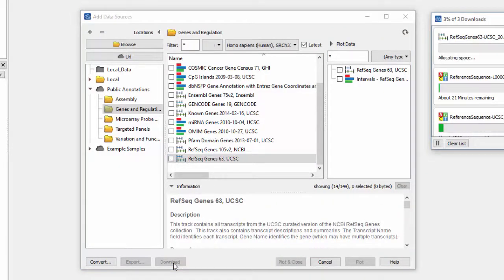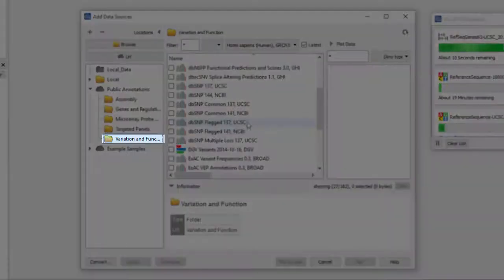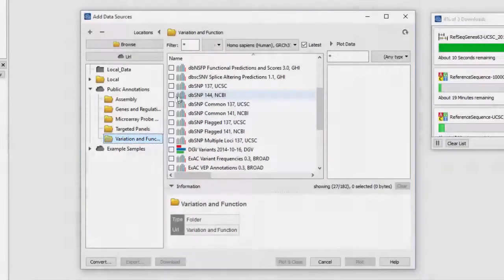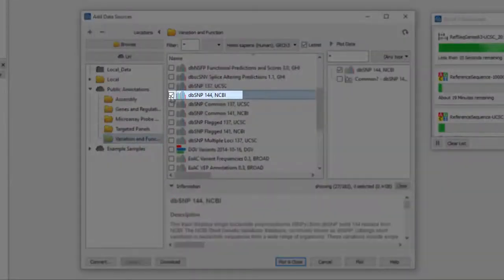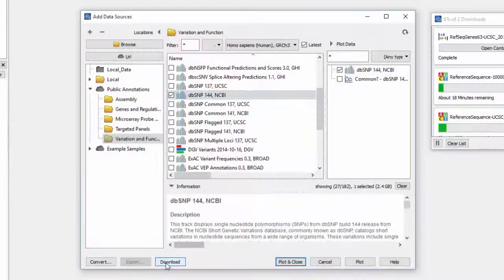Next, go to Variations and Functions, and look for DBSNP 144 NCBI, then click Download.